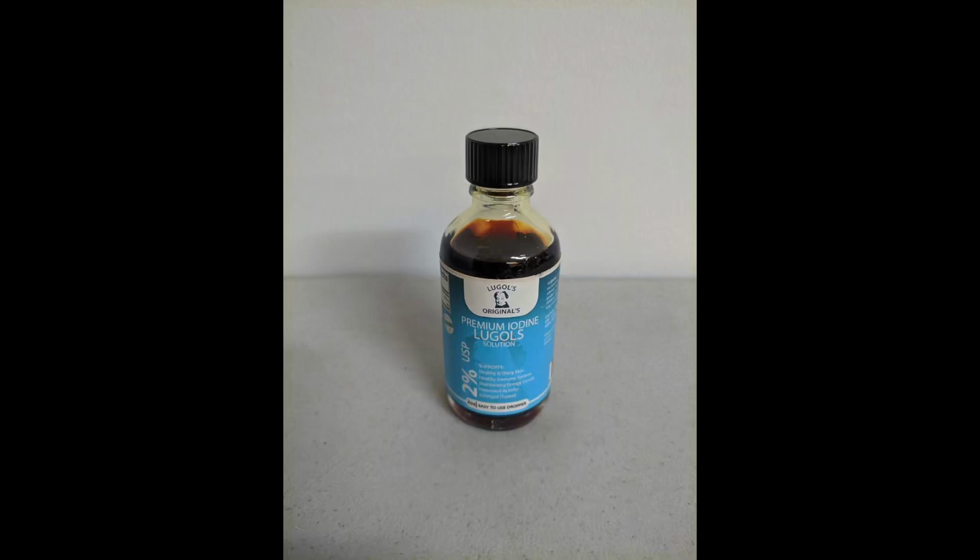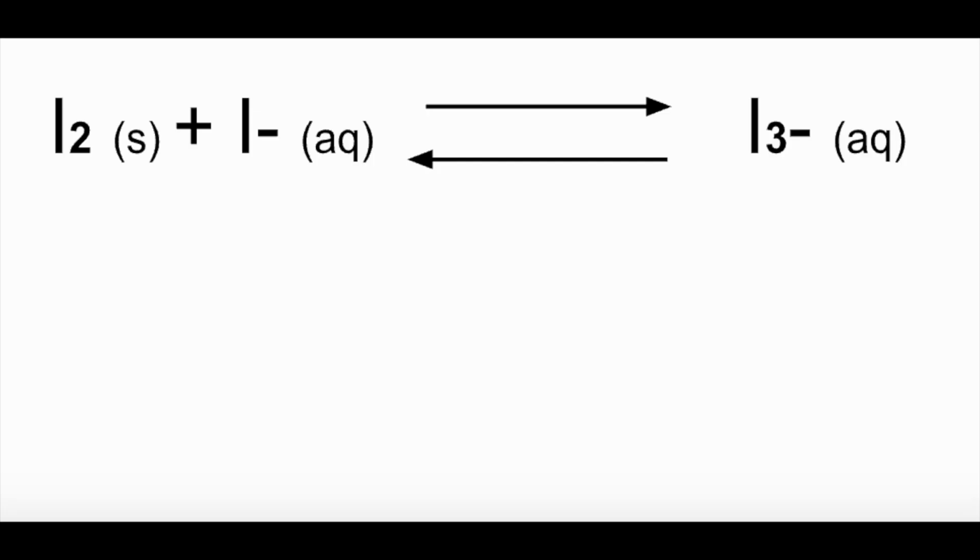Potassium triiodide was originally sold as Lugol solution, which was used to treat wounds and as an antiseptic. Nowadays, though, we use something called povidone iodine, which is iodine complexed with a polymer. However, this name is a misnomer and it's actually povidone triiodide, which is complexed with a povidone, but we'll get into that later. All triiodide solutions are iodine and the iodide ion in equilibrated complex with triiodide, which is a black or brown colored solution.